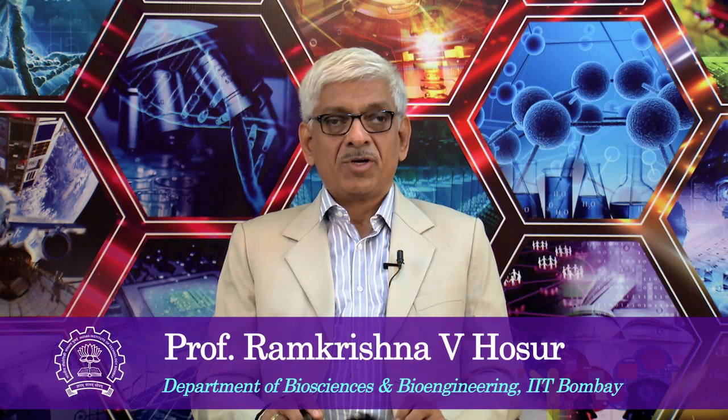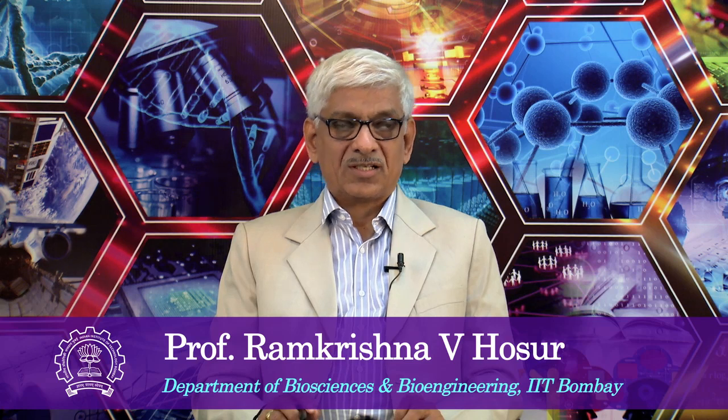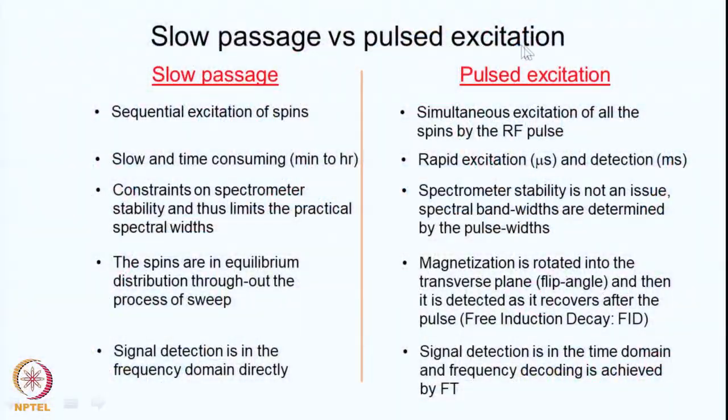So let us continue the discussion with Fourier transform NMR spectroscopy, which we started in the last class. While we do so, it is a good idea to have a brief recap on what was done last time. So therefore, I have here a general introduction and general coverage of what we did last time: slow passage versus pulse excitation. This is an integral element of Fourier transform NMR spectroscopy, and slow passage was the conventional method which was used before the discovery of the Fourier transform NMR.